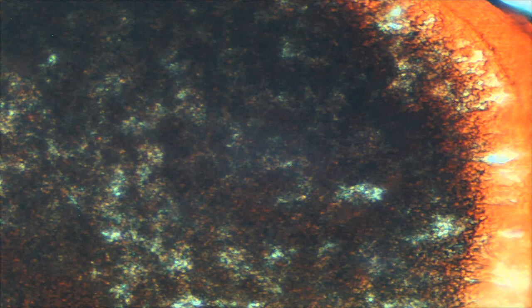So this is the farthest away zoom. It goes in about probably 900 times more than this, so we're going to get a really good look at these in a minute. But this is basically what it looks like at a glance. Oh wow, look at that! You can actually see the end of the blood right there, like the edge. It kind of looks like a red ocean. It's kind of interesting.